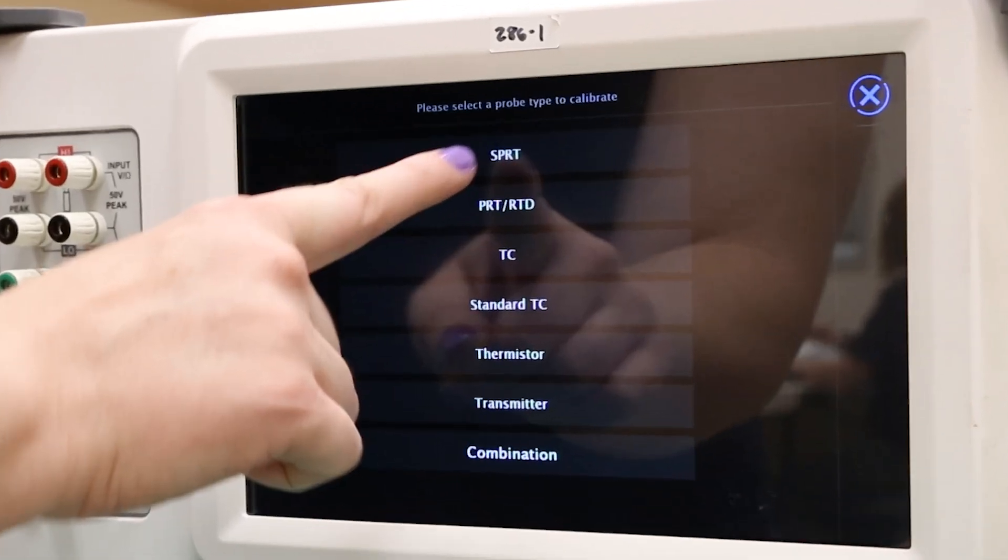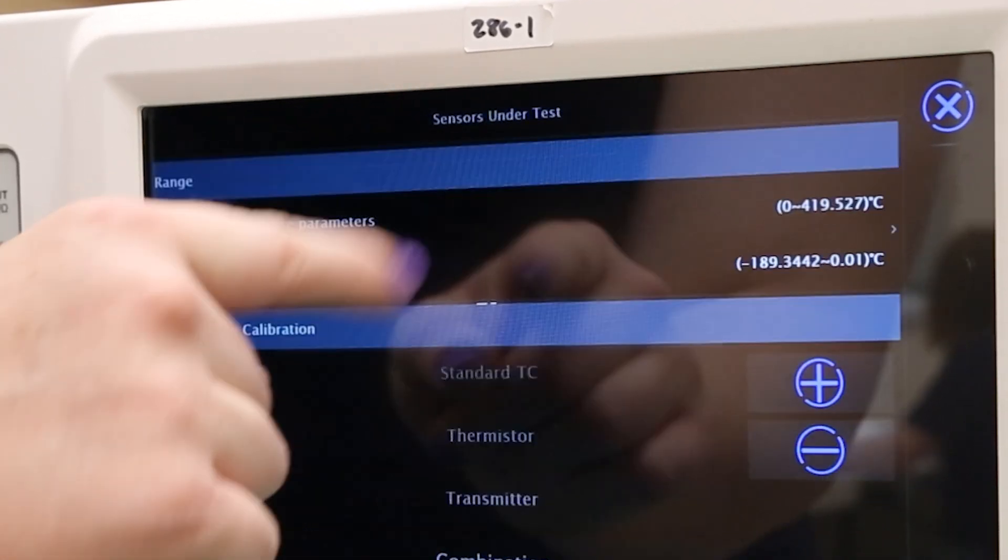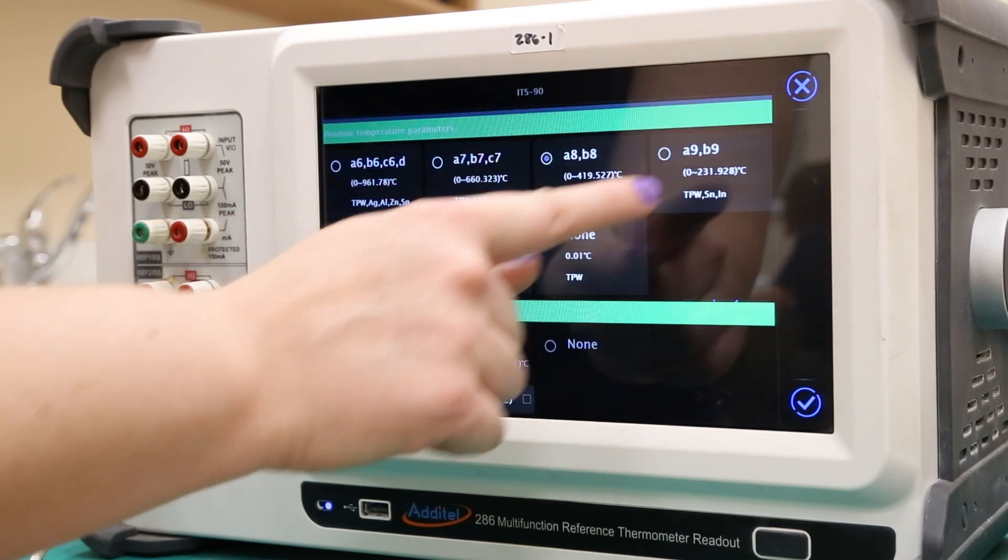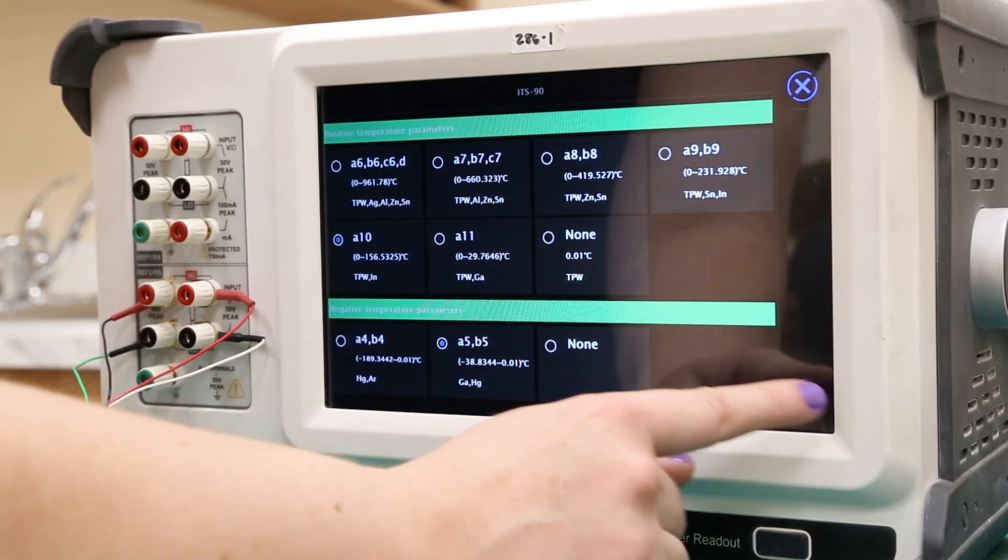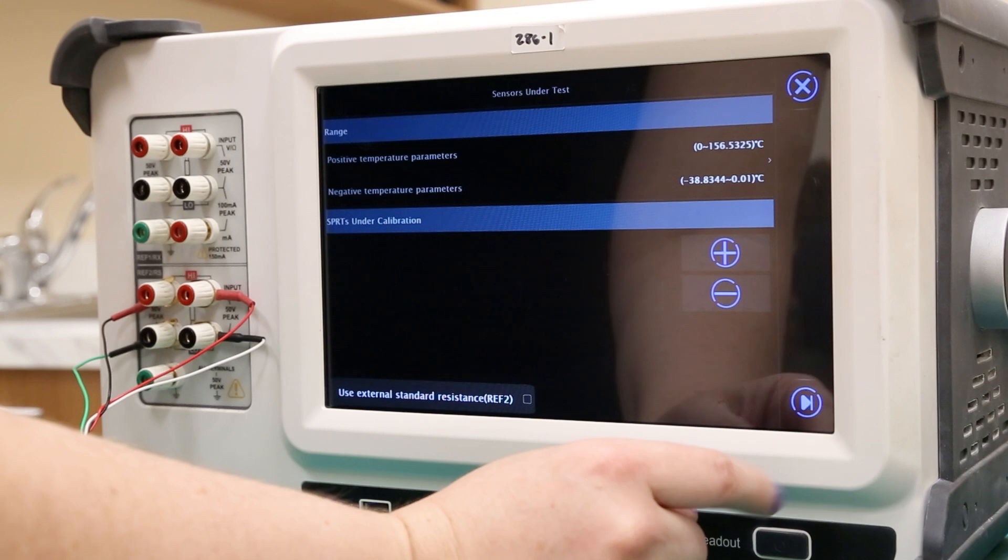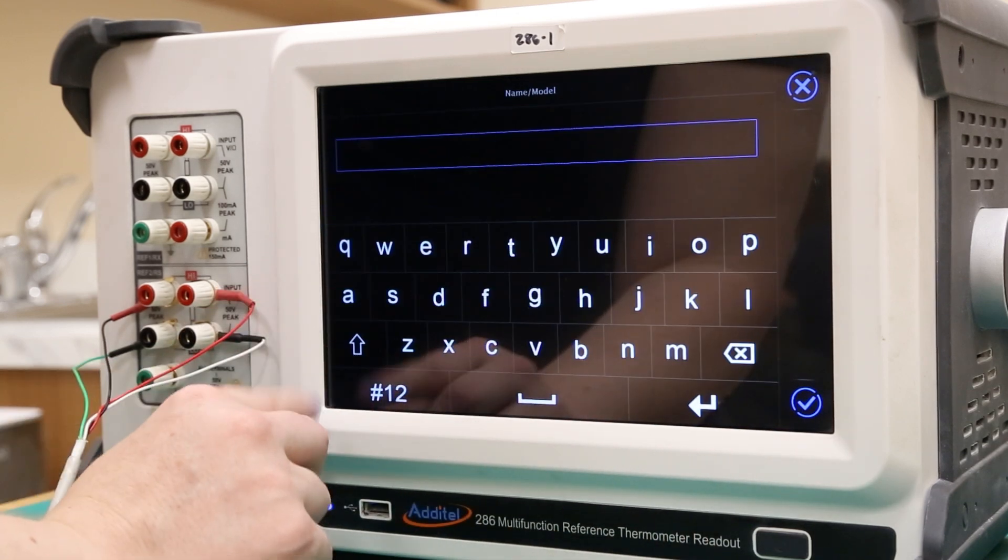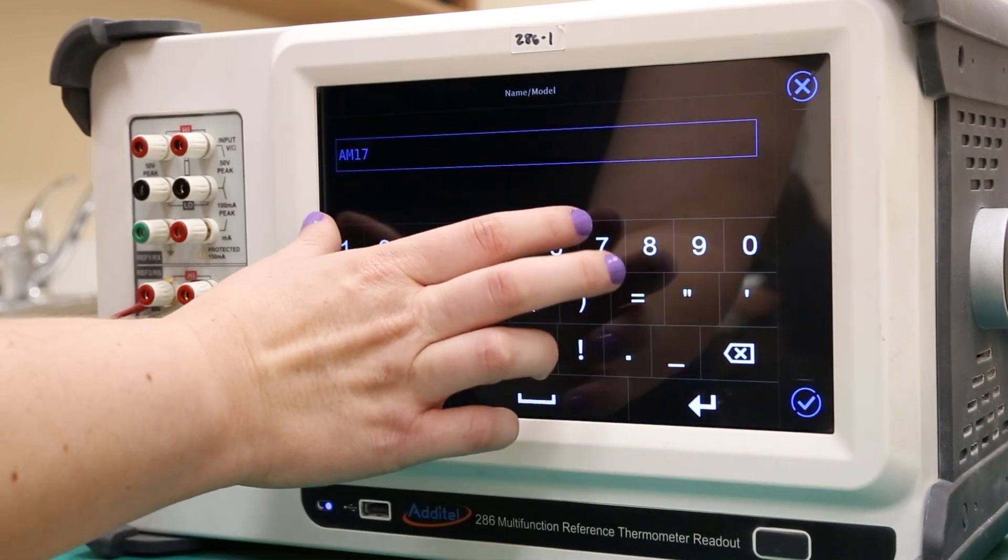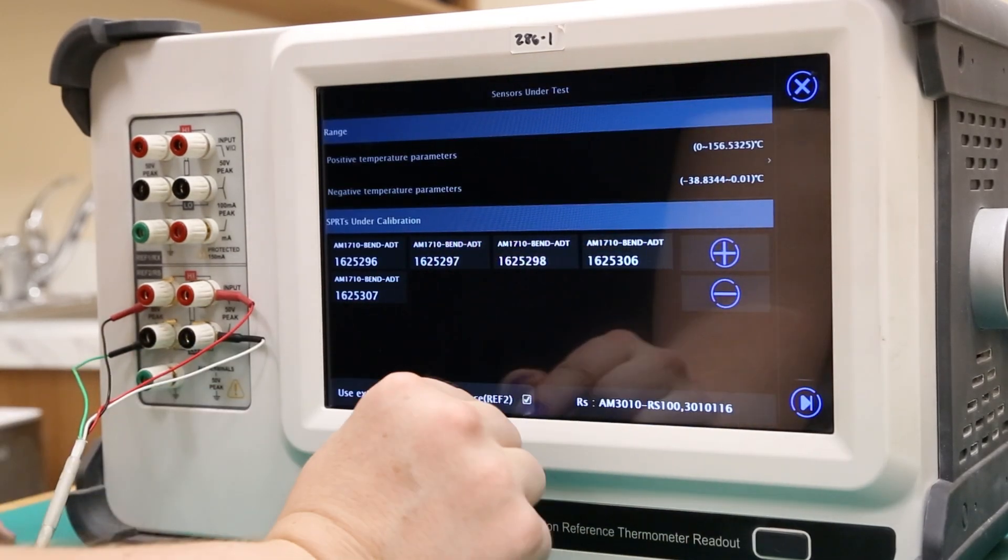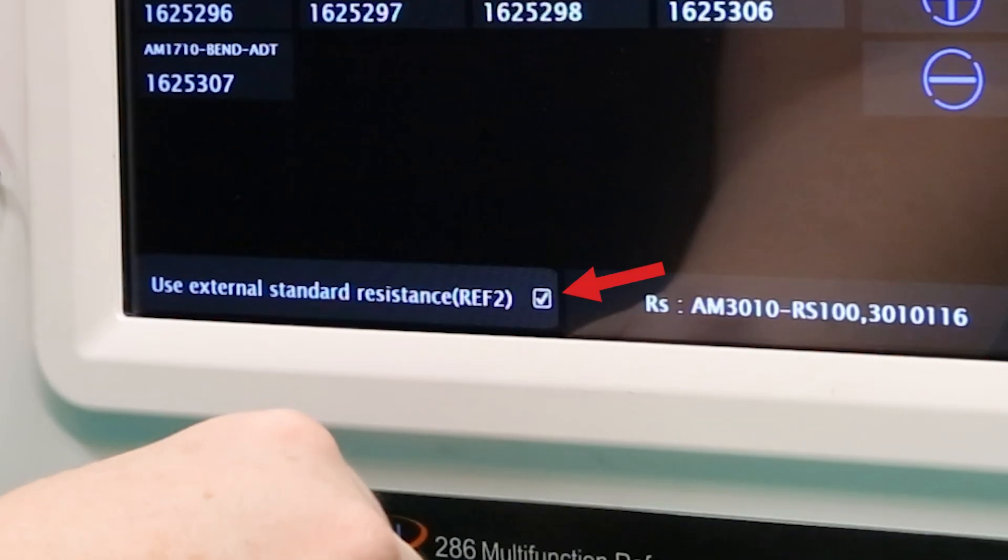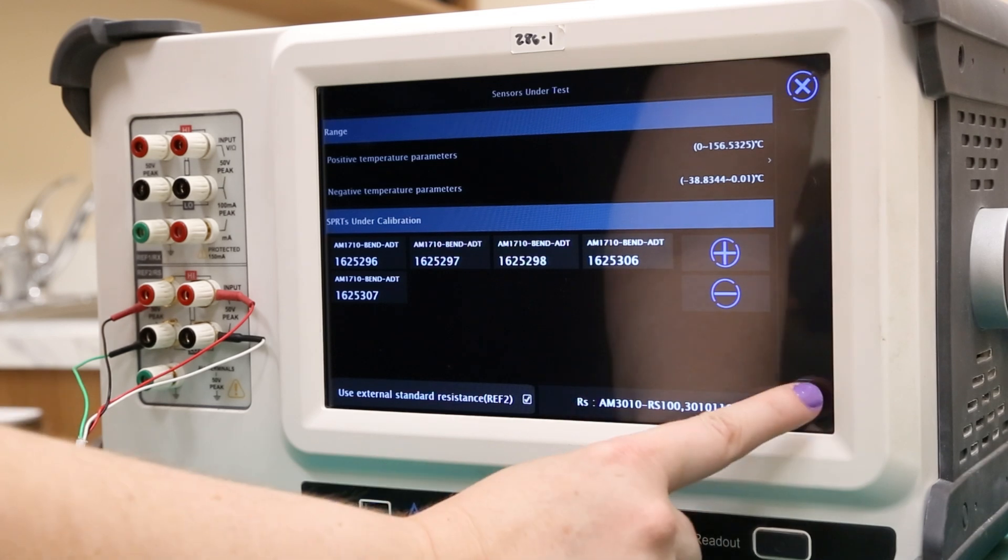Select the probe type, in this case SPRT. Here we can choose the ITS-90 subranges we will be calibrating, which are 5 and 10 as mentioned previously. Next, we will add the five SPRTs that we will be calibrating by pressing the plus icon. The name and serial number of the probe should be recorded to ensure accurate traceability. Once all probes have been entered, we will check the use external standard resistance option before pressing next.